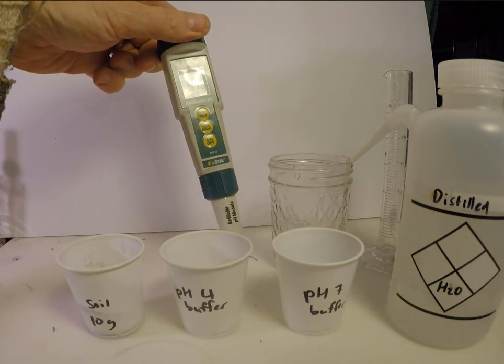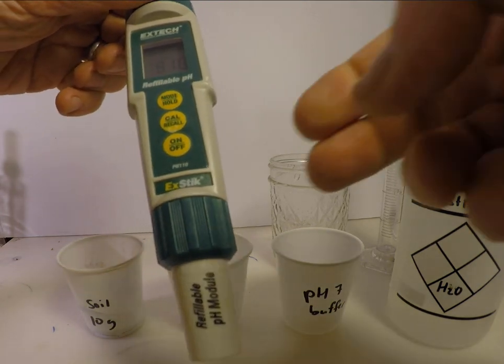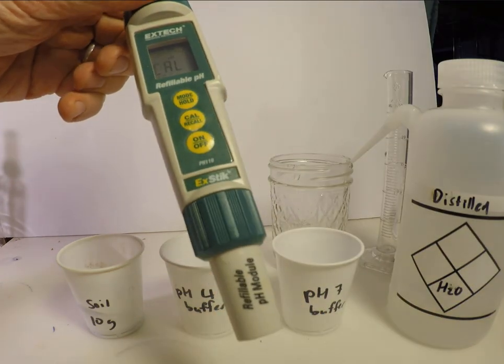The procedure shown here is similar on most handheld meters. After rinsing the probe, the pH meter is put in calibrate mode, here with a single press of the cal button.